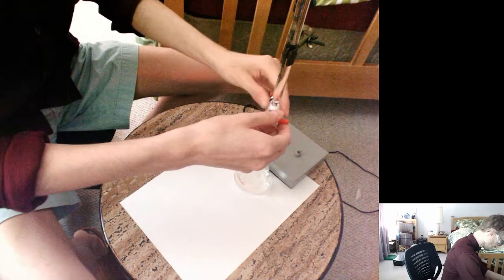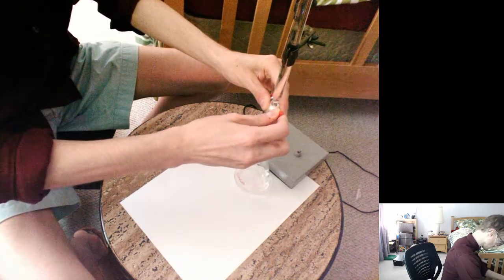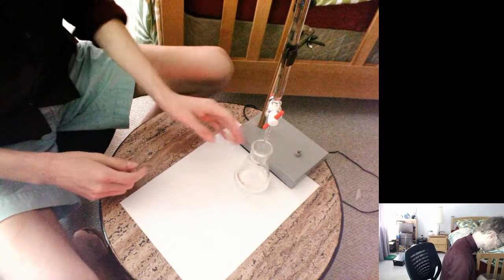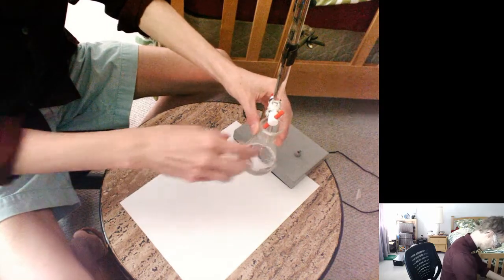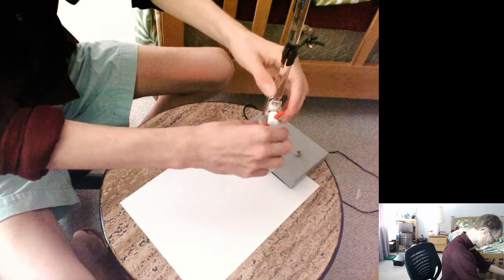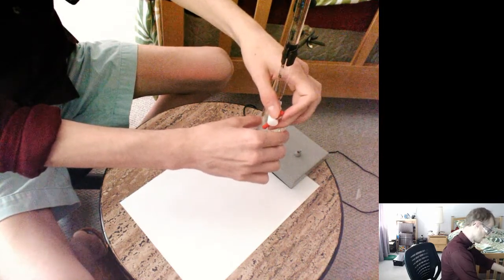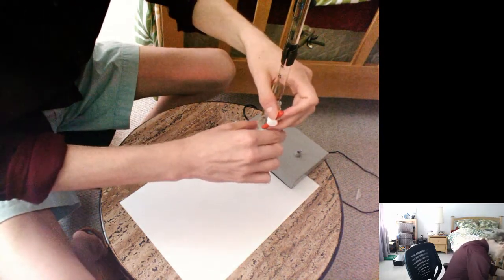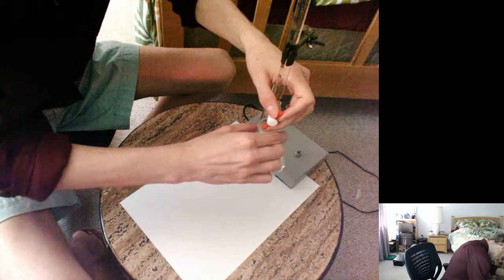So as I open this valve, some of the base is going to start dripping out. And so I'm going to let it drip at a slow rate, if I can get it. So just a few drips at a time while I stir this around is sort of the best way to do it. Hopefully you can see the solution swirling around a bit, but I'm basically watching the solution to see when it starts to turn very slightly pink, and I'm going to slow down. So I'm looking. Some of these drops are turning pinkish a little bit.